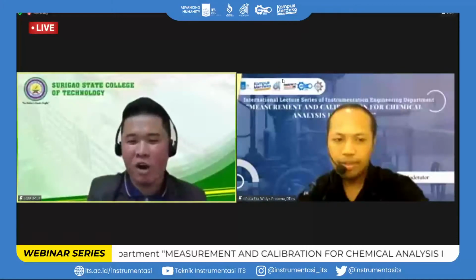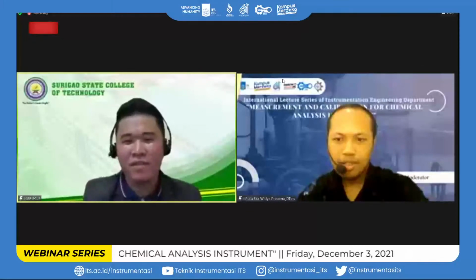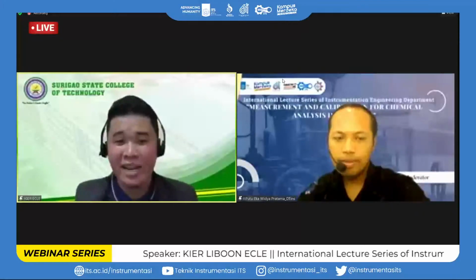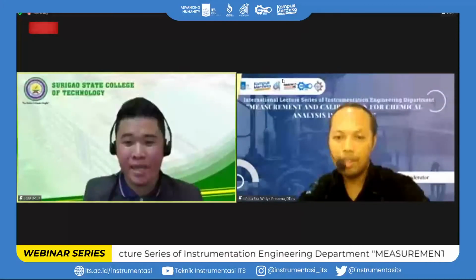But for the composition or structural elucidation of these molecules, or hydrocarbons, it is more on infrared or NMR, nuclear magnetic resonance spectroscopy.